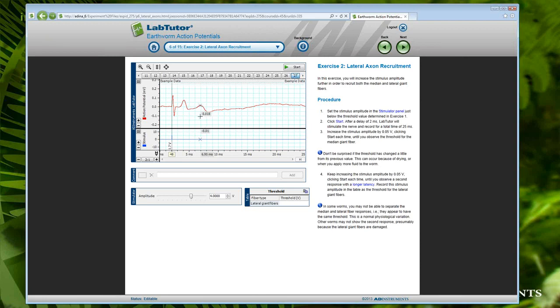So again, this is from a different worm at a different time, recorded at a different temperature with a different electrode configuration. So it's really not meaningful to compare this data to the previous data that we're recording today, but it is a useful data set for students to complete the analysis if they can't actually record their own, right? So here's data we collected today.